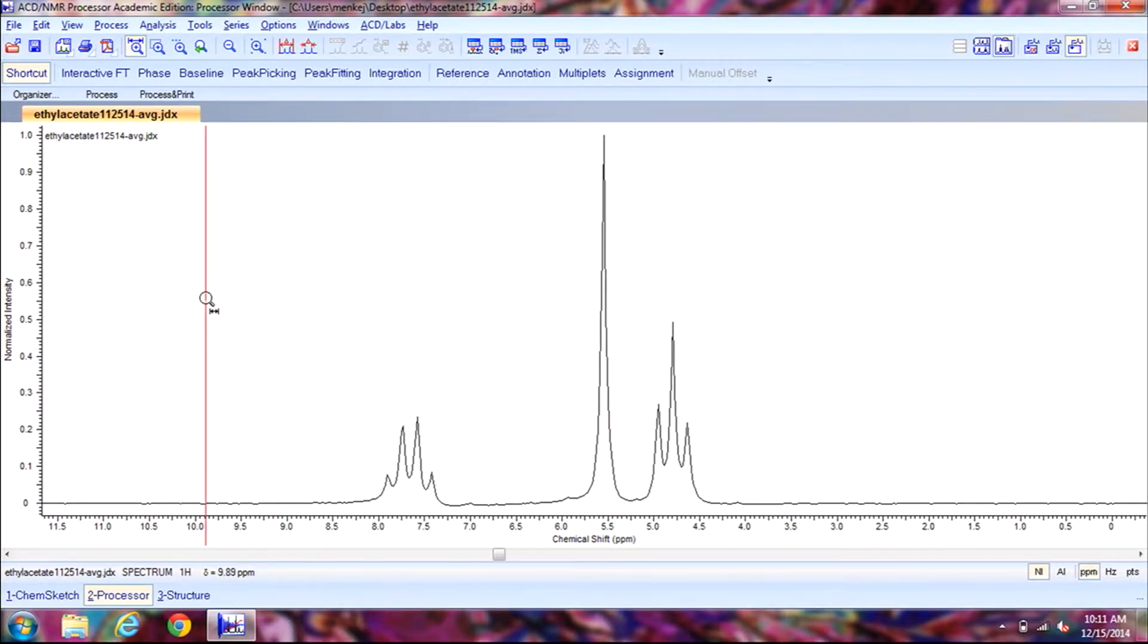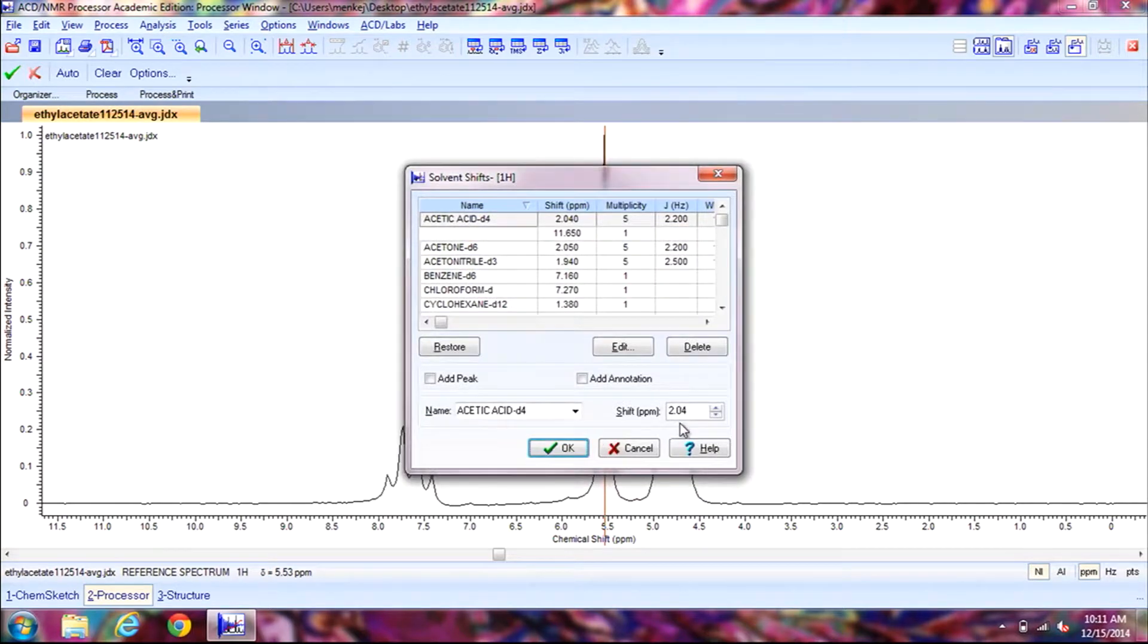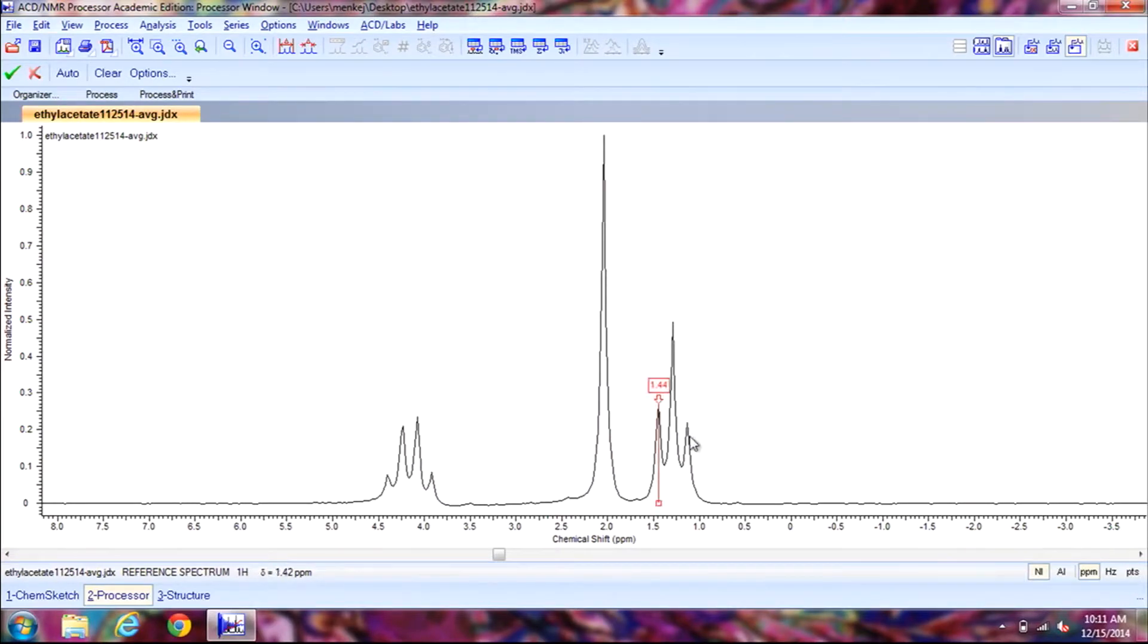And now we're going to reference our spectrum. So we're going to click on reference. There should be a known peak value that will be provided to you by your instructor. So we're going to reference our peaks by using your mouse to click on the peak that you want to reference. For example I know that the middle peak should have a value set to 2.04 ppm. So I'll enter that value here and then click on OK, and that shifted and referenced all the other spectrums for me. Now I will click on the green check mark to exit out.